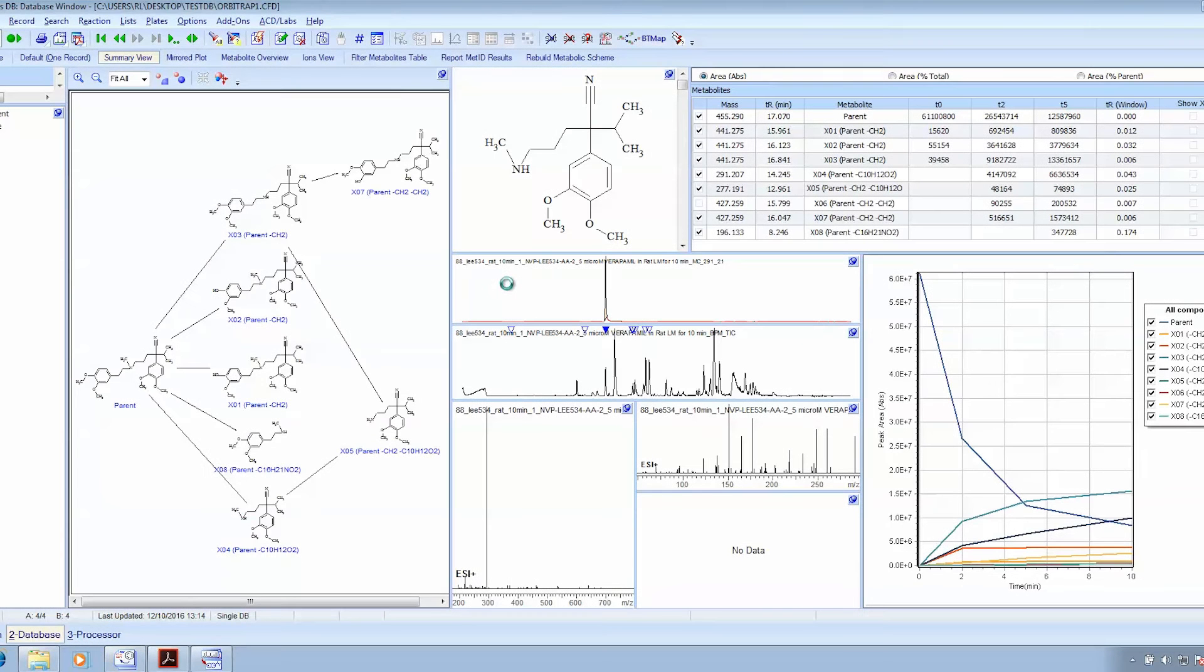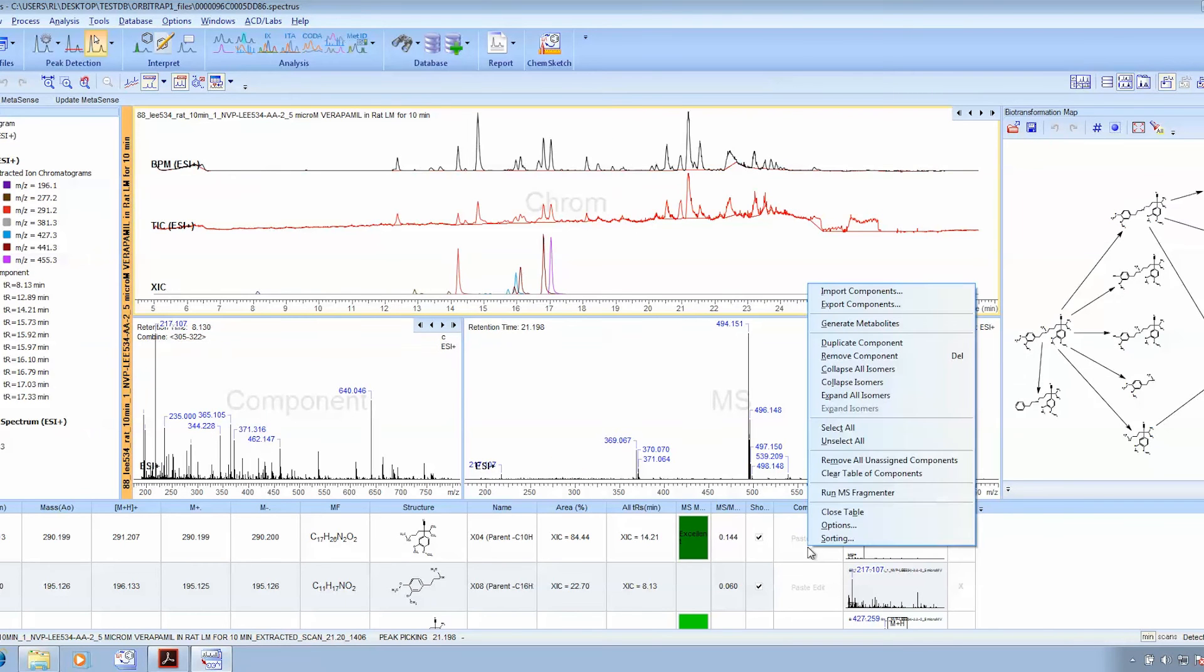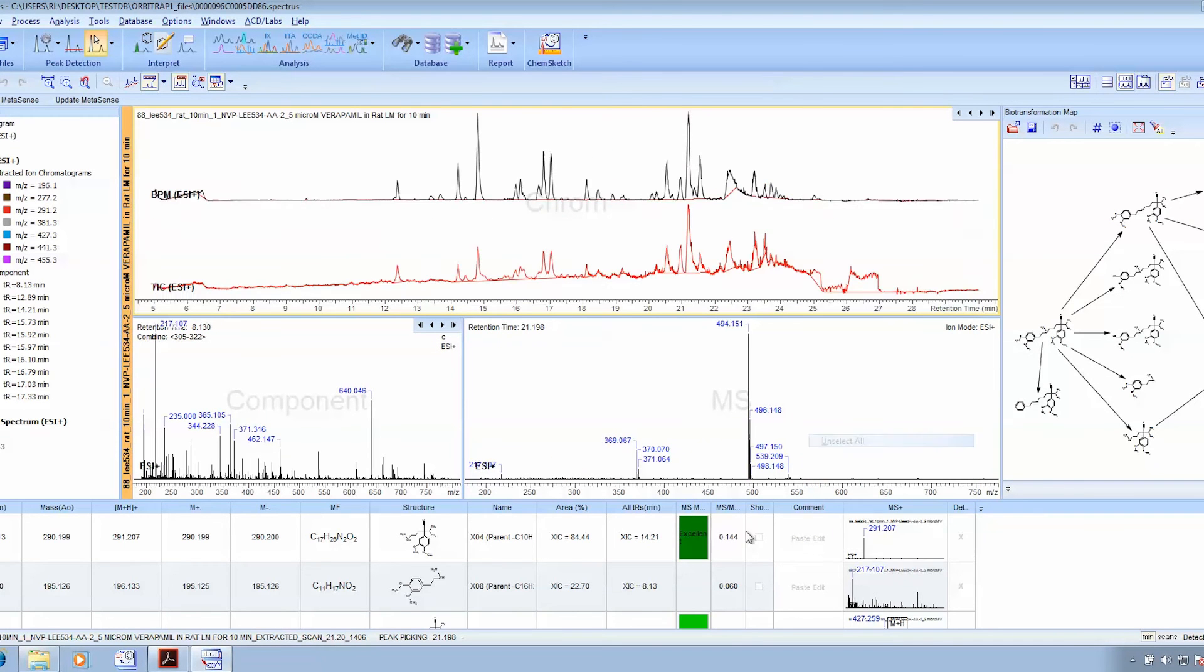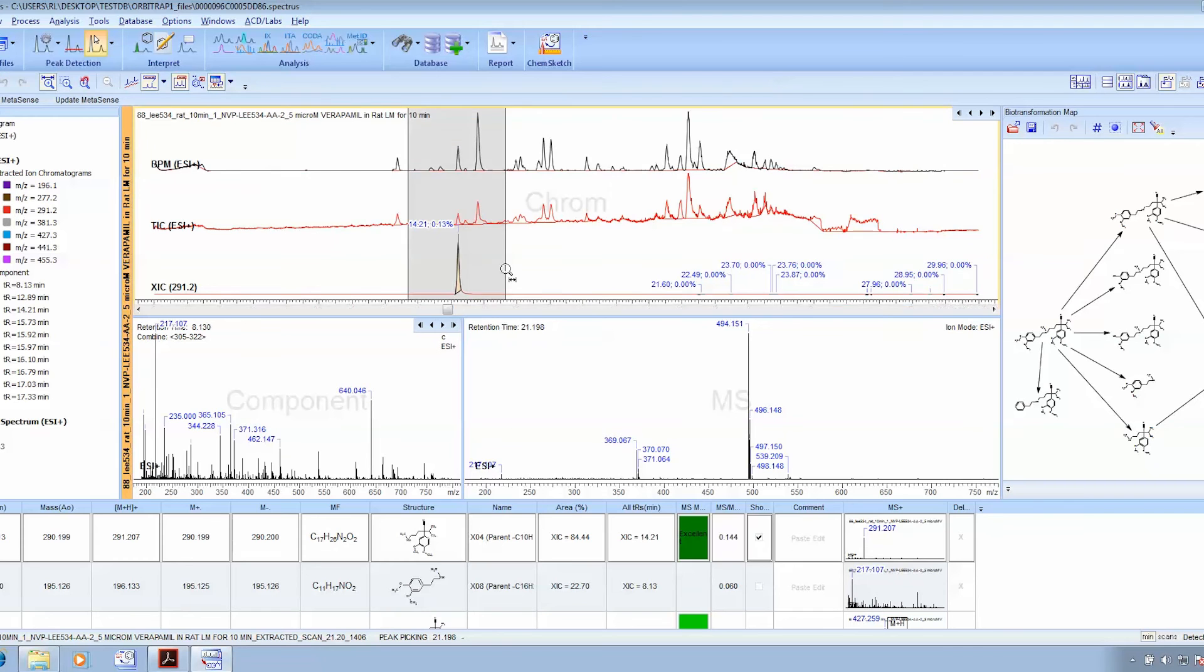But not only does MetaSense offer an automated processing routine, but it also gives the user full manual control. We can adjust peak areas if you wanted to, because we have a fully fledged processing interface.